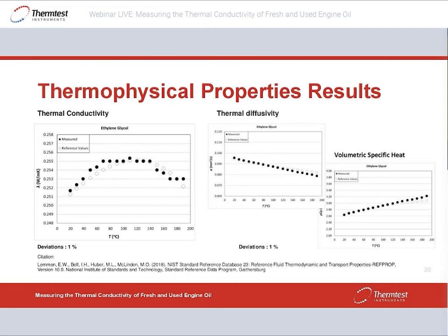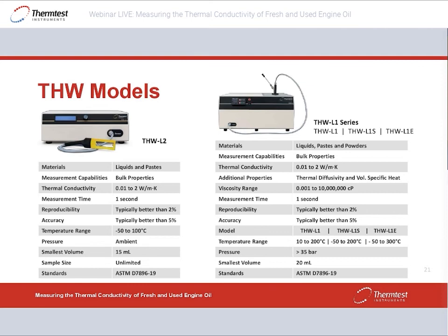And all these results, as I said, are coming directly from the THW software. So the user is able to directly analyze and compare the results.